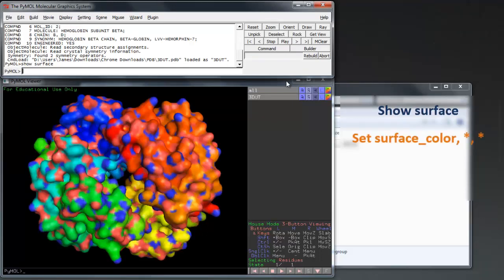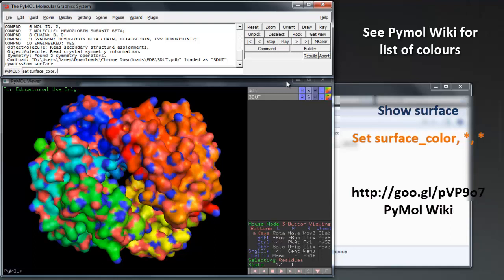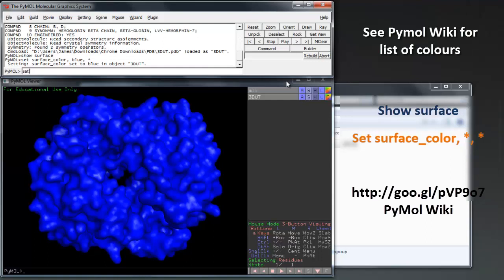To change the surface color, use the command set surface color followed by your color selection then the target object. In this case the object selection was all, so we annotate with a star. You can find more colors on the PyMOL wiki.